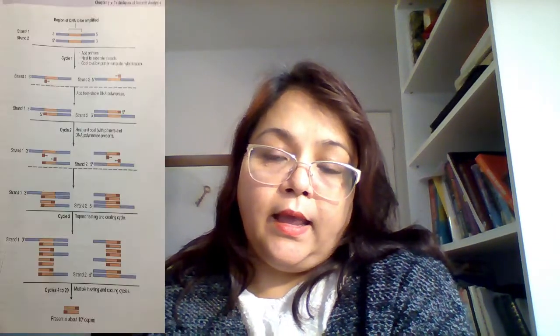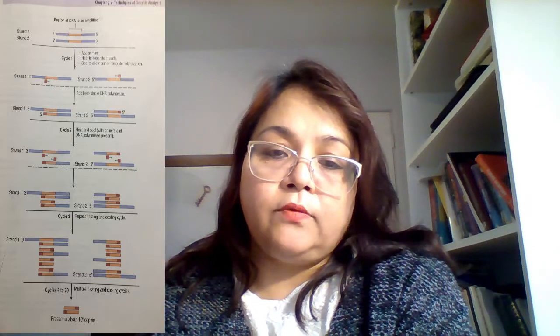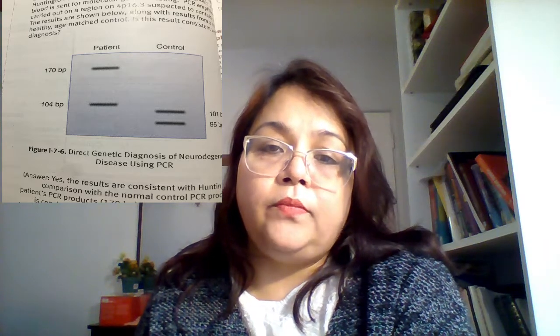If it matches, then the primer will attach to the target, and the primer also has fluorescent dye. So it will be easier to detect once it is attached to the target. It will produce the fluorescent band in the autoradiology or the machine at the lab.